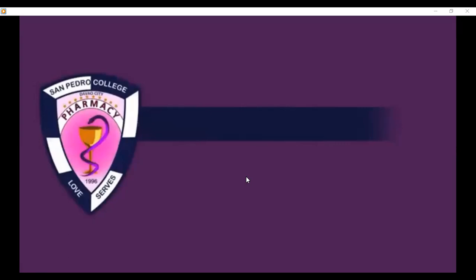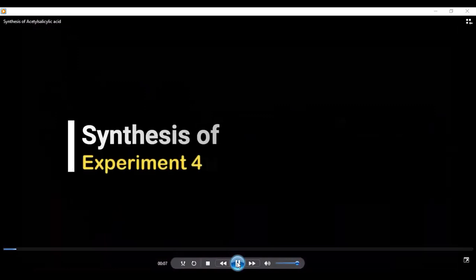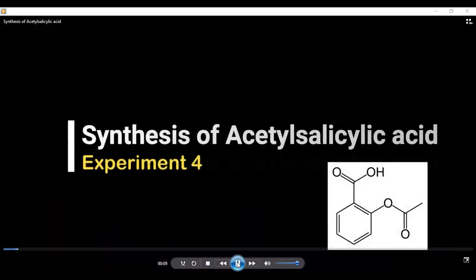I'll start with the narration of the video recording. In this experiment, once again, experiment number 4, the synthesis of aspirin. Aspirin is chemically known as acetylsalicylic acid.